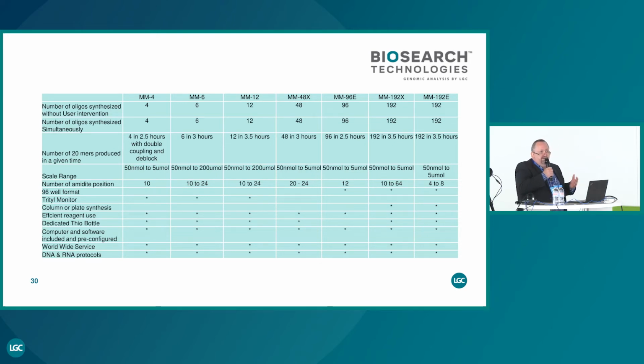If you know you will make oligos with a lot of modifications, let's say DNA, 2'-O-methyl, LNA, I don't know, 2'-fluoro, that's already 16 positions. So it's good to take enough positions directly. It's sometimes possible to upgrade afterwards, but it will be a cost. So I think it's good to do it.